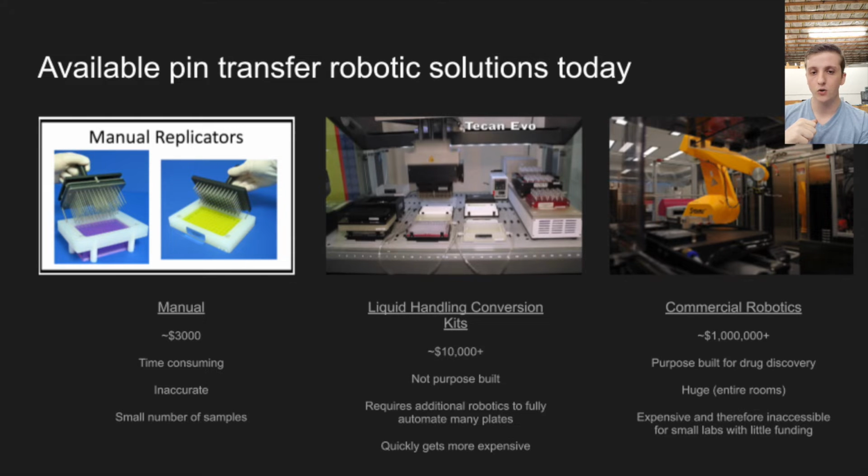So if we could have a robot that's similar to liquid handling conversion kits, that is cheaper and can also deal with multiple plates at the same time, that would be amazing for these laboratories, and that's what we sought out to do.